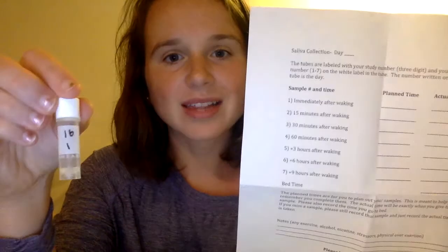Now, there is also a page that looks like this. So both of these items are important. So when you're looking at the tube, we'll use day 0 as an example. As you can see on the tubes, your participant number is labeled there. So your participant number 16. 1 correlates to the sample number that you're taking on the sheet.